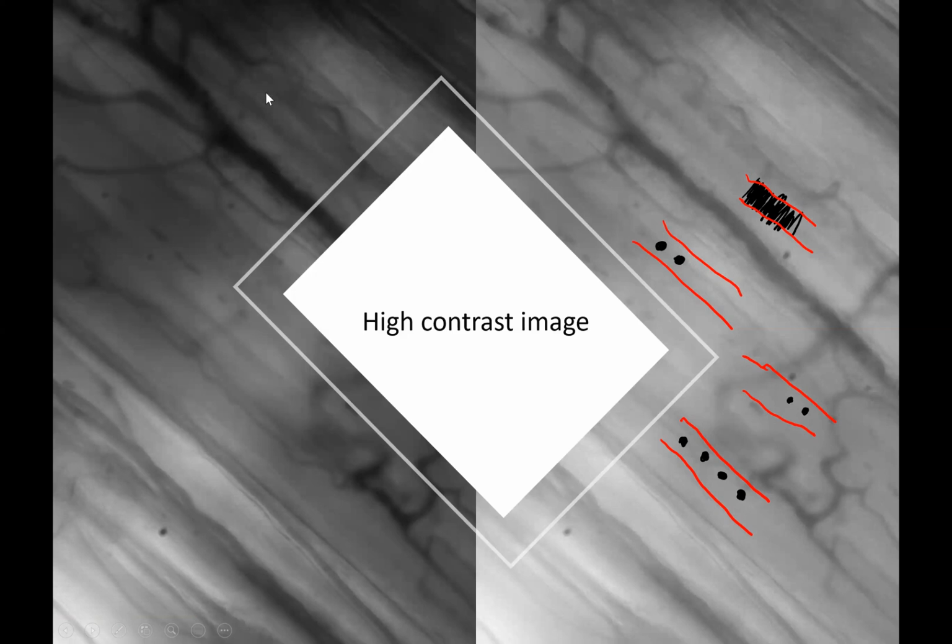We can see this one has a higher contrast, and for the original one, we can see just some dark points in the vessel. If we take a mean of all the frames, we can have a higher contrast image. With a high contrast image, it is easy for us to do edge detection to generate the binary image. That's why we need a high contrast image.